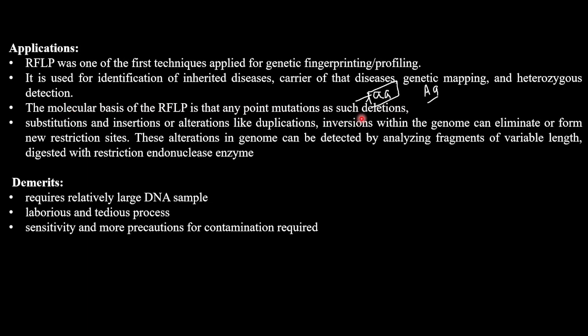So if there is any mutation, deletion, substitution, or insertion in the site recognized by the restriction enzyme, then the fragment is not going to be cut by the restriction enzyme. So you will get a different fragment size. These alterations in the genome can be detected by analyzing fragments of variable length digested with the restriction endonuclease enzyme.